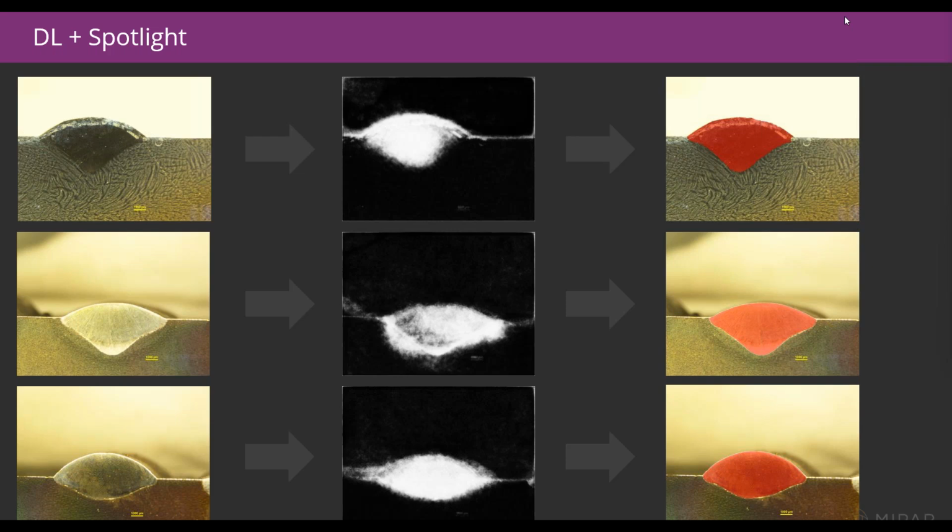Okay, we're coming down to our last couple of minutes here, but we'll try and get a few more in. Can we measure an intermetallic layer in PCBs? So we do tons of layer detection and thickness measurements. I'm saying the answer is 99% chance yes. We would just want to look at the specifics of your image to give you an absolute concrete answer. If you can see the layer in the image, if there's something that tells you here's the layer, then almost certainly yes, we can automate its detection and measurement.